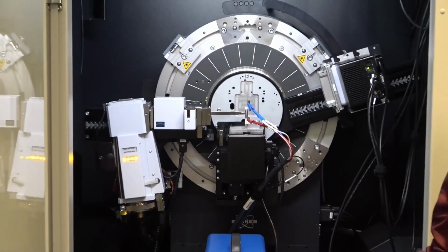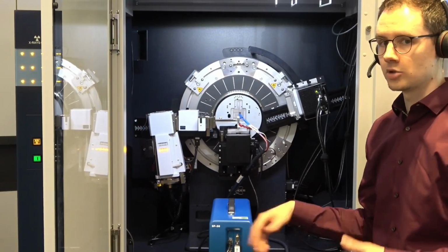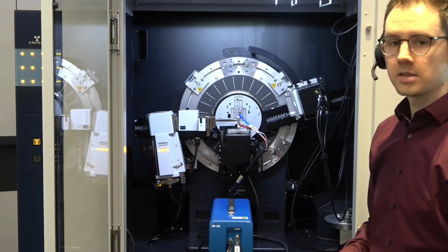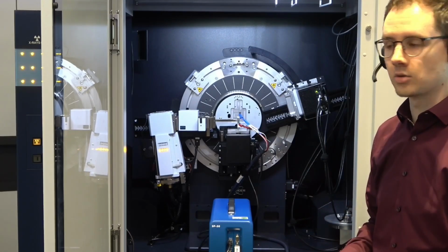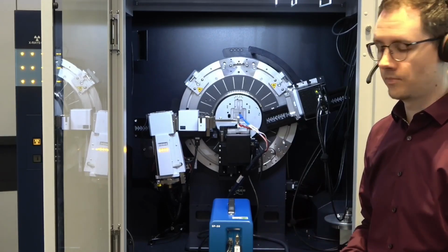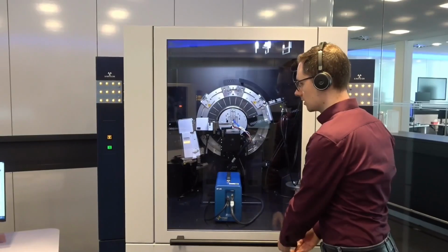To charge and discharge the battery, I will be using an SP50 potentiostat, which will allow me to charge and discharge while I catch XRD scans. So here we will cycle the battery and continuously record XRD scans, which will allow us to have a look at the structural changes during the cycling experiment. We call that operando XRD, operando analysis. To show you how this is done, let's have a look at the software.